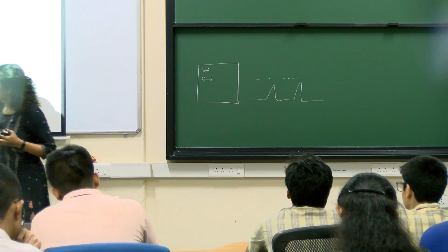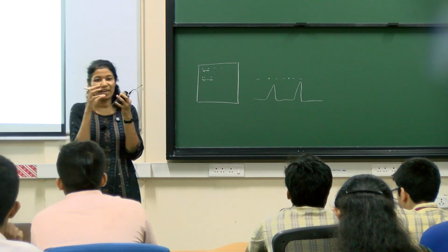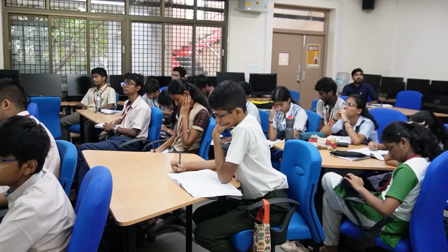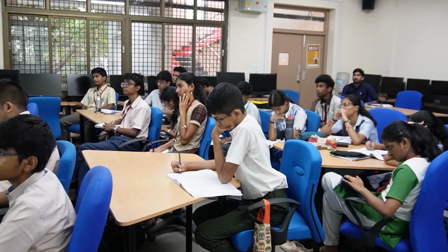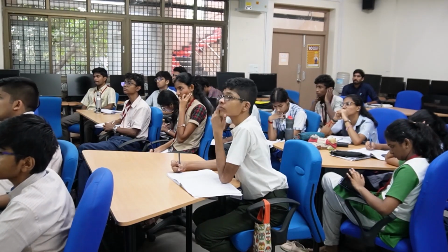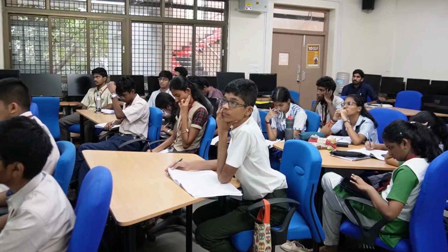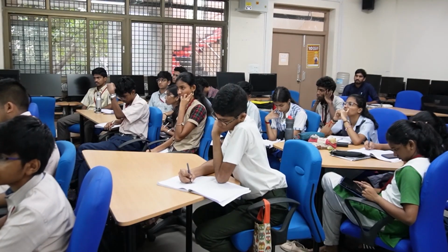In this case, you can't make out if this is one or two spots. They are very close together. So we say it's not resolved. Whereas the third case is at the borderline. That's the criteria. We call it the Rayleigh criterion, where you can make out that it is two spots. It's not very good, but you can make out that it is at least two spots over there. And that is a minimum distance you need.